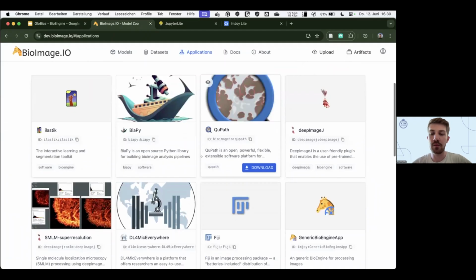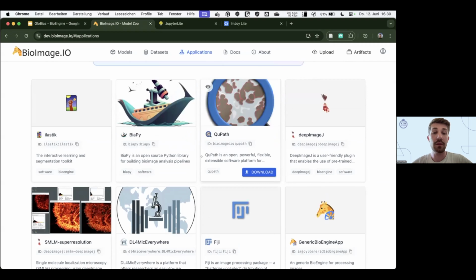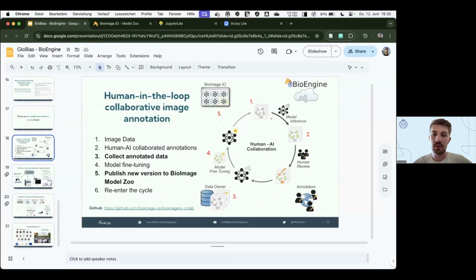At the moment, we have the model runner for Bioimage.io models, and also there's a Cellpose fine-tuning deployment that is being used in this workflow here. Where is it? Here. So you use Cellpose in the Cellpose fine-tuning process here. But you could serve any vision model. You just need to write your own deployment file for that, and this is pretty straightforward to do.